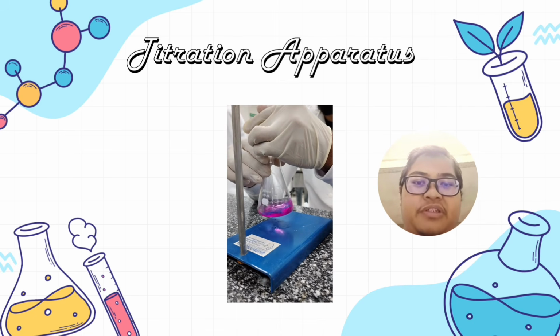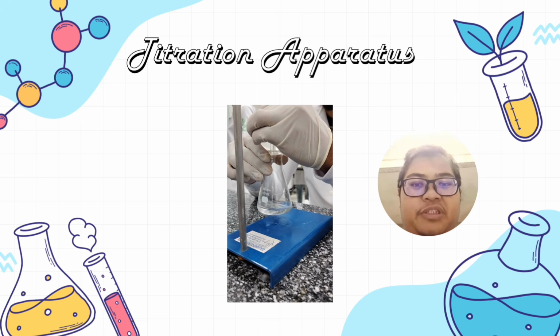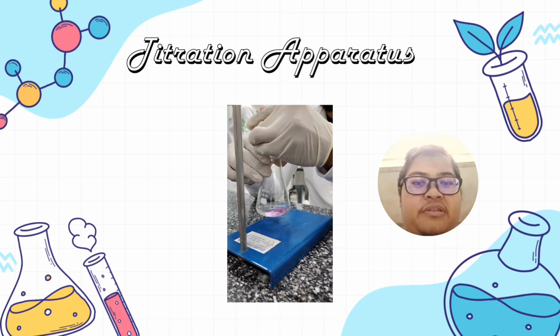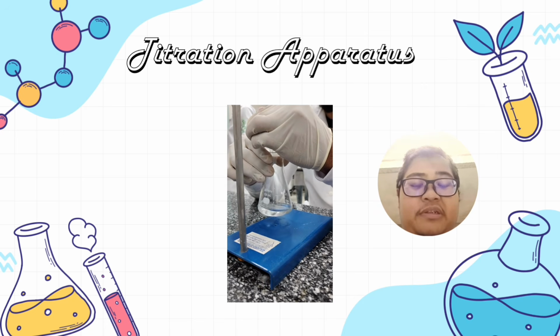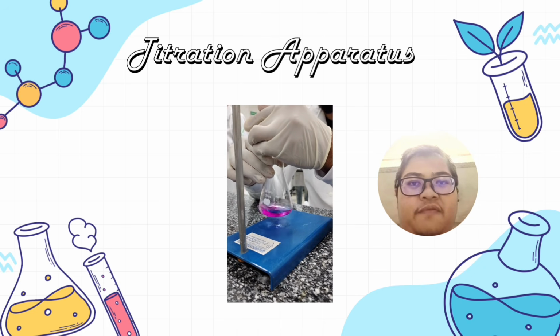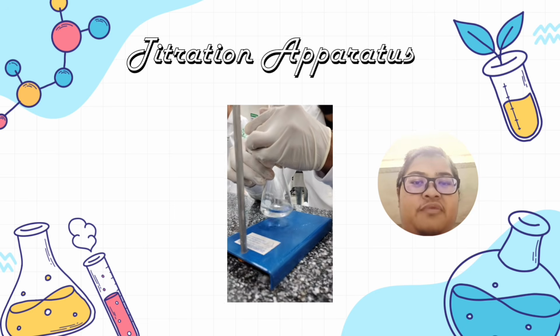During the titration, the sodium hydroxide is added slowly while the flask is gently swirled to ensure thorough mixing. The titration is continued until a permanent color change is observed, indicating that the endpoint has been reached. This setup allows accurate measurement of the volume of titrant used and helps determine the concentration of the unknown solution.